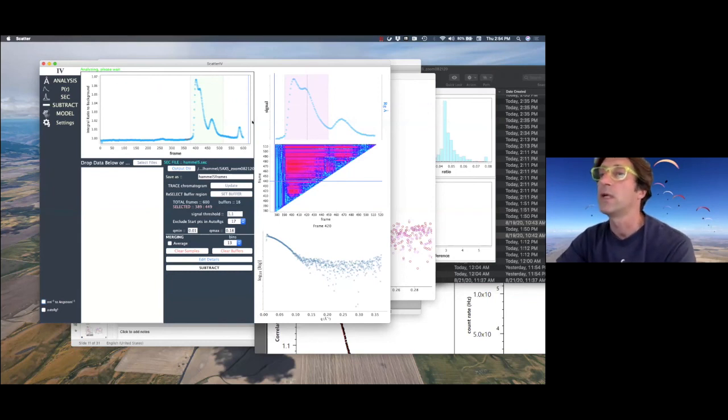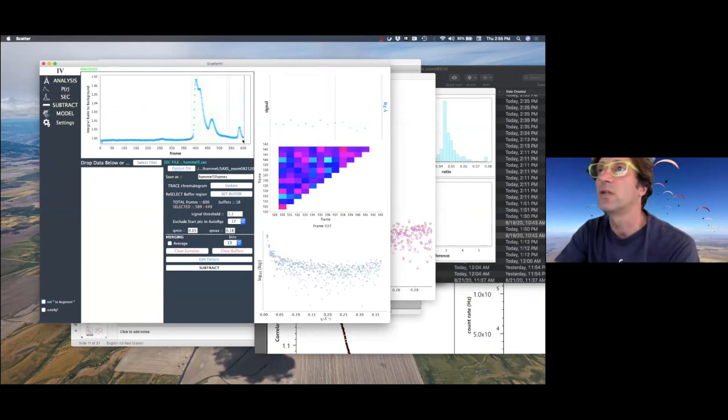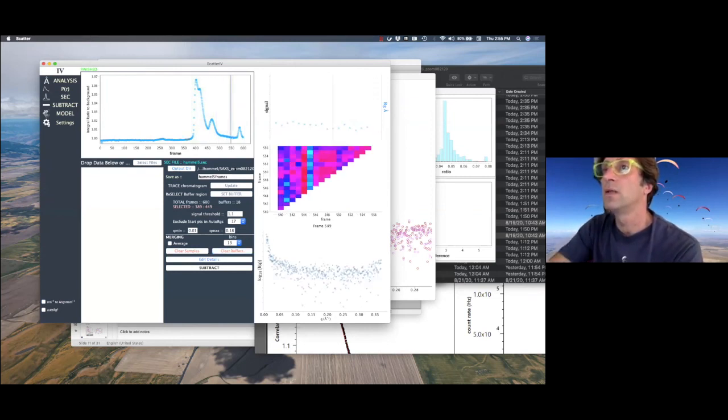So capillary fouling and a problem with the drift of the beam, that your beamline has too. You show that in your case too. There's a slight problem with this drift in the beam that caused the problem. So in this case, you really want to cut the data as much as possible. And what I recommend, subtract here. Let's say do a subtraction here of the buffer at the end and compare those curves. Let's do it right now. We update that.